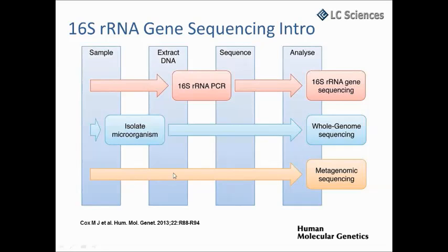And for 16S rRNA gene sequencing, we are not going to sequence the whole genome from each species. So we just sequence the amplicon targeting the 16S rRNA gene.